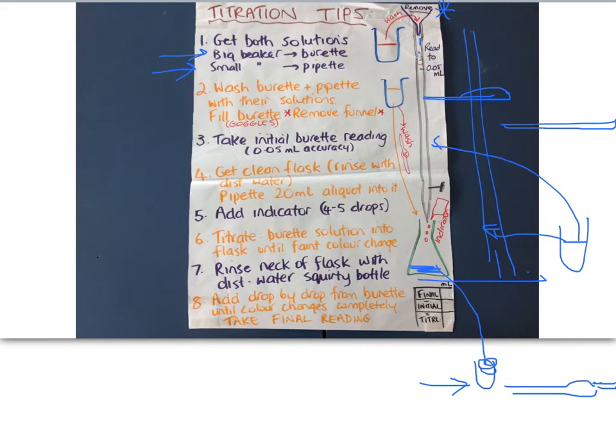You take your initial burette reading, remembering to go from the bottom of the meniscus. You don't have to start at zero. It just wastes time if you're always trying to take it up to zero each time. Whatever it is to start with, that's what you want to record for your initial reading in a table that looks like this. Putting your initial reading there.